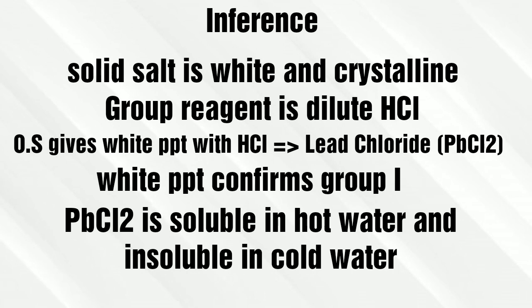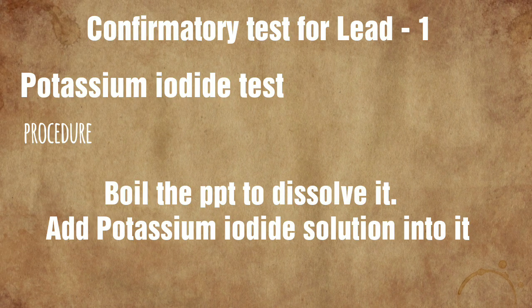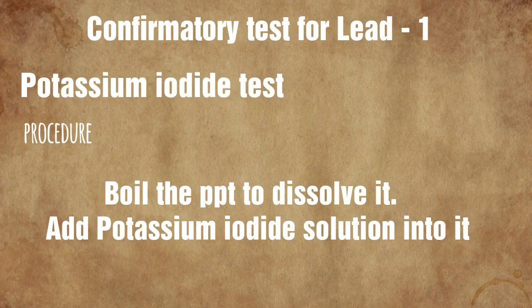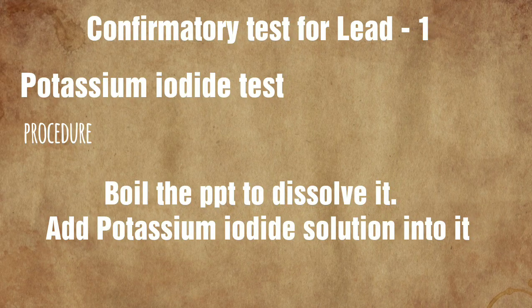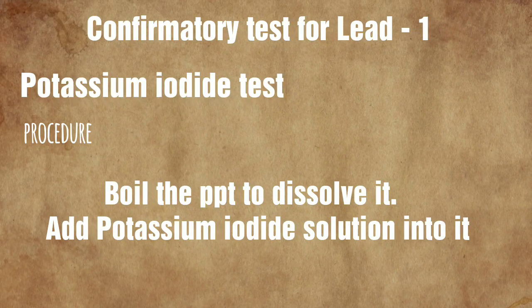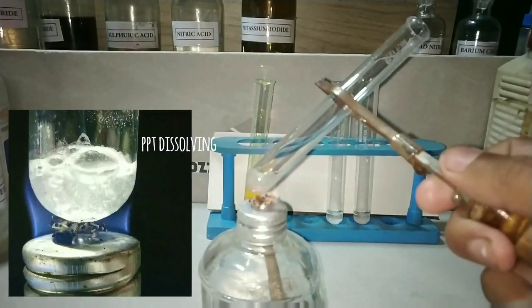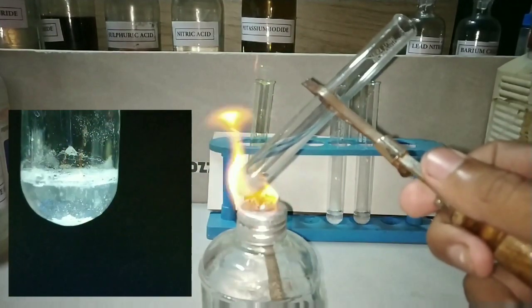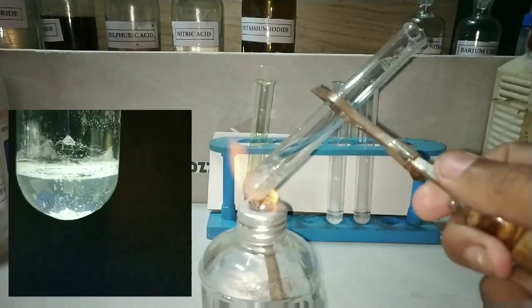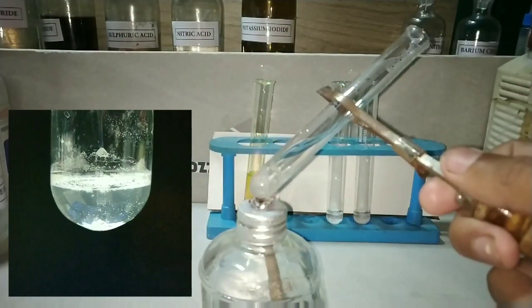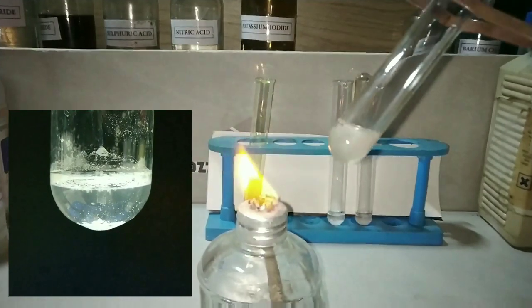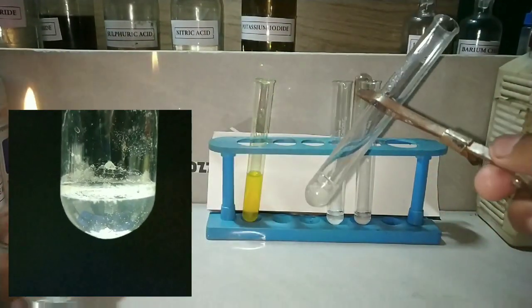The original solution gave us a white precipitate of lead chloride. Lead chloride is soluble in hot water and insoluble in cold water. The first confirmatory test is the potassium iodide test, where we boil the precipitate to dissolve it and then add potassium iodide solution. On boiling, the precipitate is dissolving and the solution has turned clear.